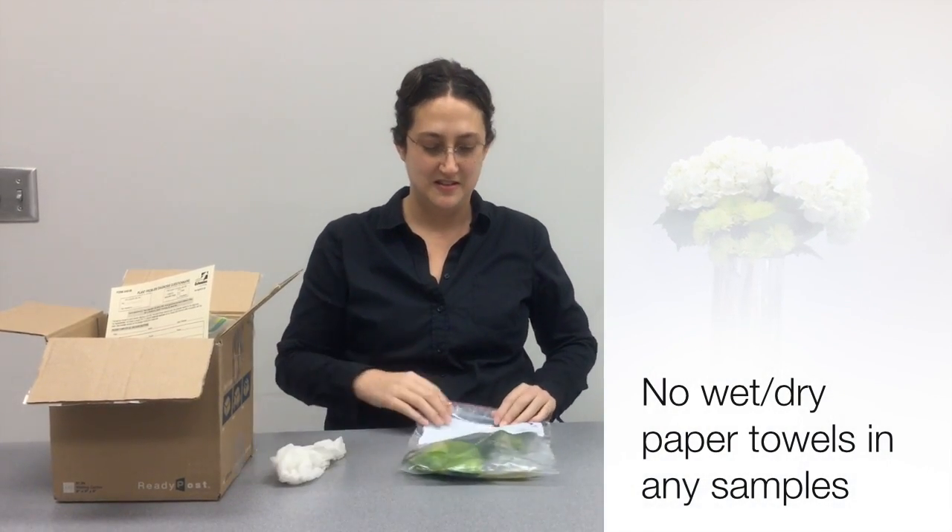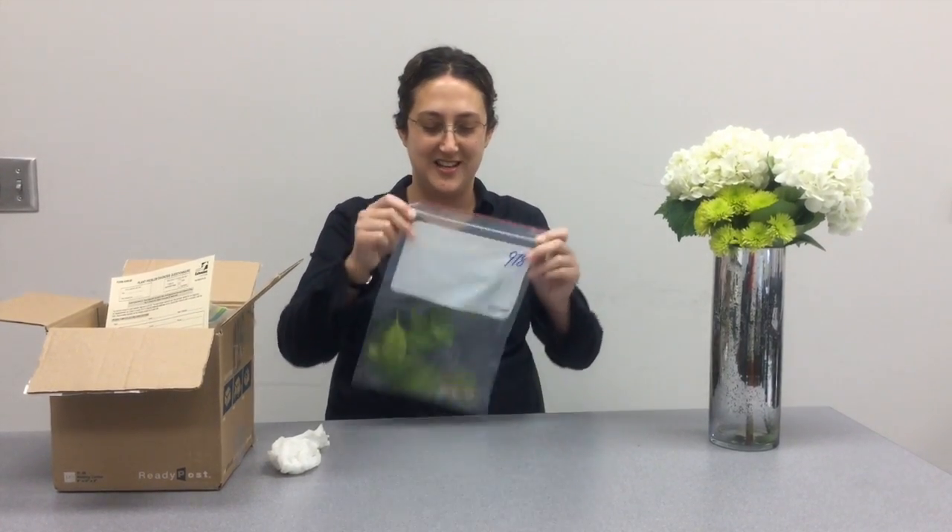When packaging samples, do not put in wet or dry paper towels. Do not send in dead plant samples — they have to be alive. And do not place them in an envelope. All samples need to be placed into a sturdy shipping container so they do not get squished in the mail.